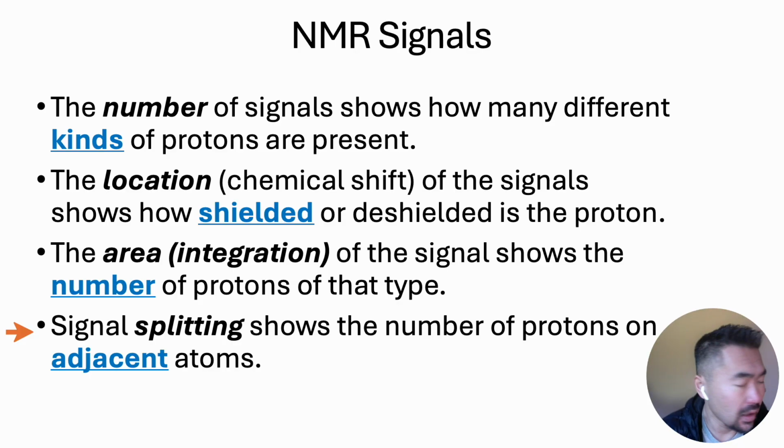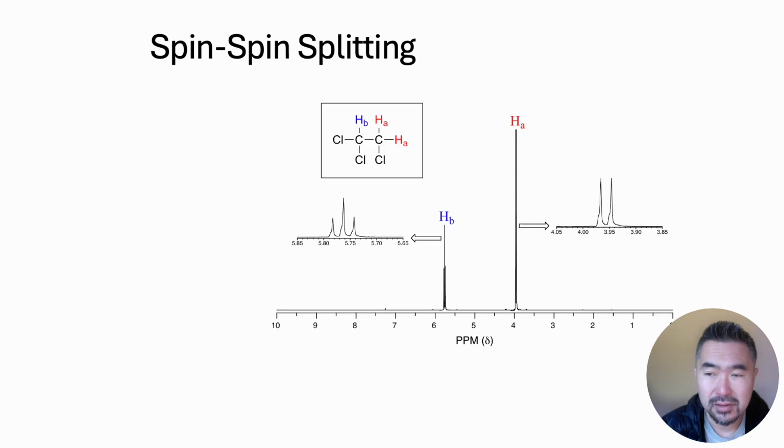I think in the last video we talked about what the chemical shift and the integration, the area under each peak, help us interpret in terms of clues about the structure of the molecule we are analyzing. The last, but one of the most important, is the splitting pattern that you might or might not see for each signal or each peak. So that's the main focus today.